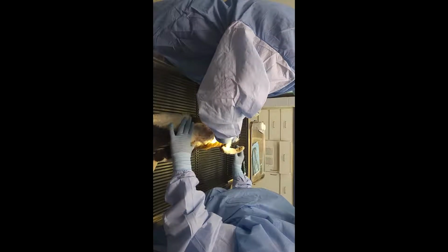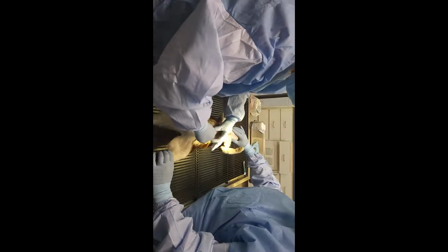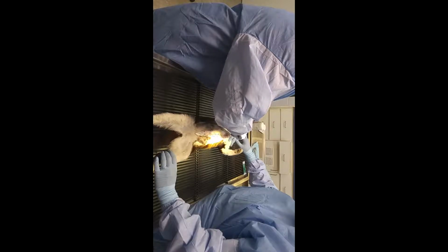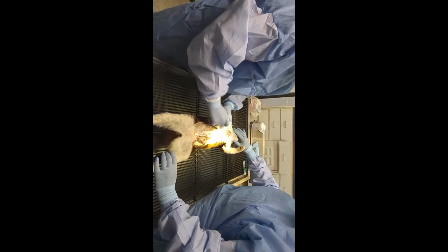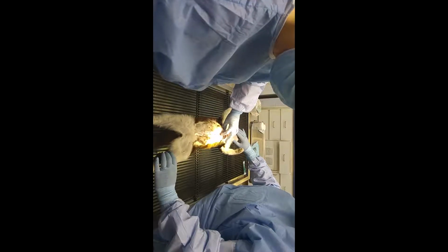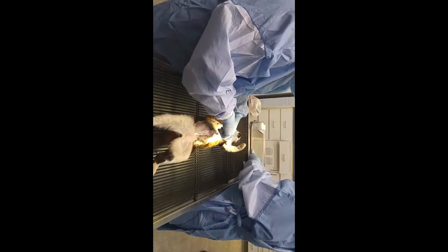Top of the chest here. And I'm just going to go ahead and extend my skin incision all the way down the abdomen. Of course, we've got to have a little bit of milk in our way there. Okay, now you can see we're actually down to the rib area. If you will hand me those bone cutters, I'm going to just start by making a little stab incision to kind of get us started.